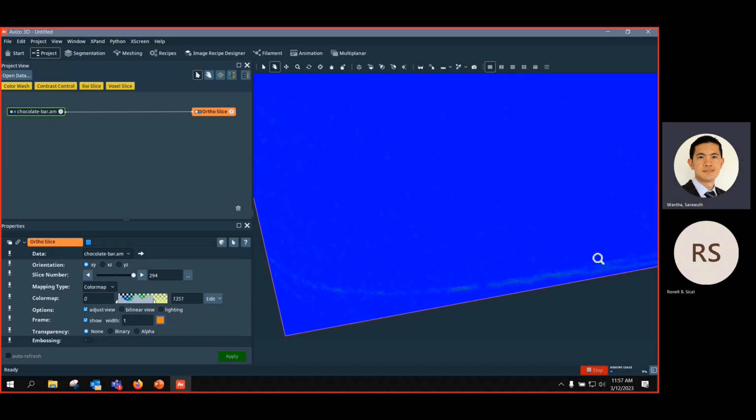Is it working? That's why we need a mouse for this training, because it's really useful to use a mouse. And then we have this step rotation. This could be used, for example, if you want to create a really steady animation of turning or rotating an object. And then look at this seek tool.